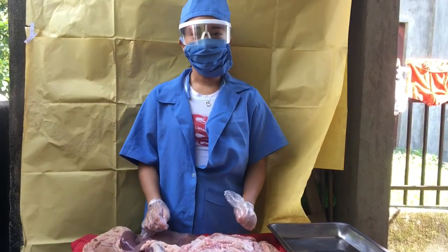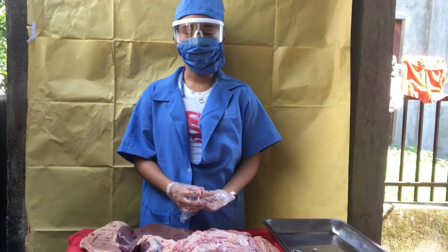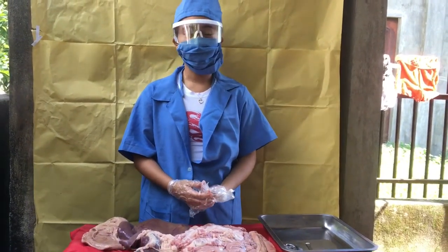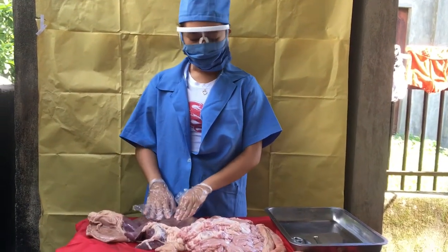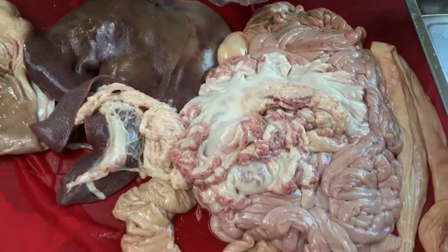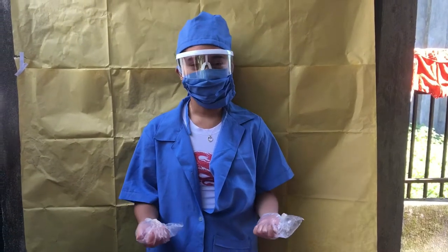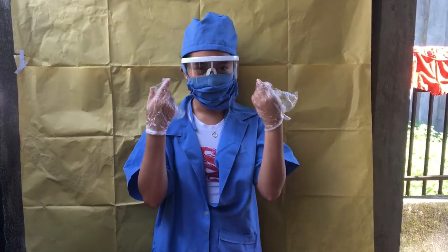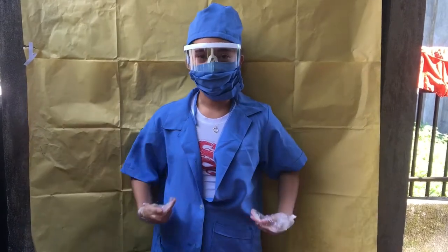Good day, everyone. I am Ivan Swandila Lichizamora from BSN 1D. Today, I will be dissecting four organs, which are the stomach, liver, intestine, and an eyeball. I have already washed my hands, and I am also wearing protective gear such as these goggles, face mask, and a laboratory gown.